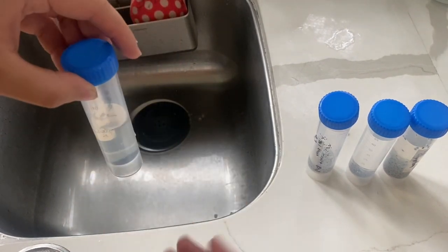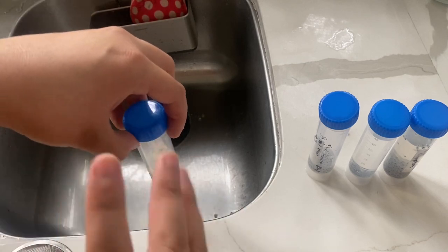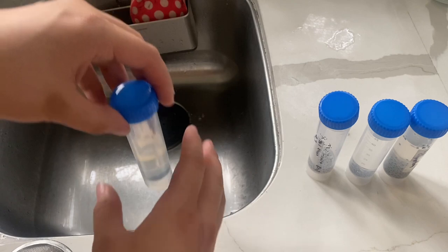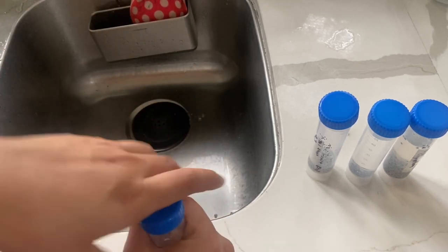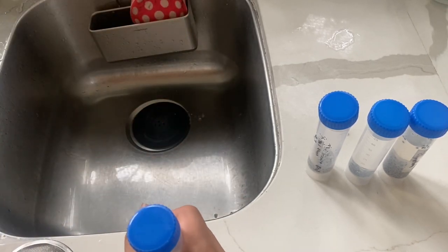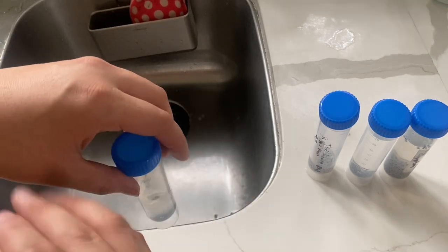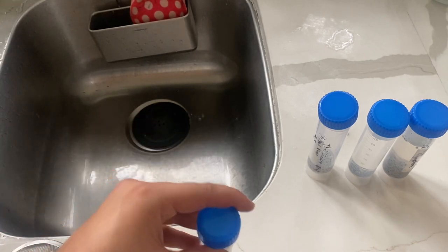So the first thing we're gonna do is rinse off all this water that we've been soaking for about 6 hours. It has a lot of bacteria and spores inside of it from mold. So we're gonna dump that out and then rinse this with isopropyl alcohol, 70%, for about 30 seconds to a minute. Dump that out, and then we're gonna add bleach, 10% bleach, for 20 minutes, and then rinse that out with water, and then put them on some petri dishes to germinate.